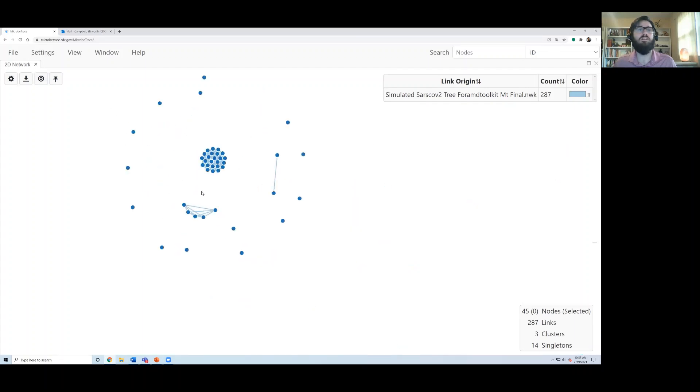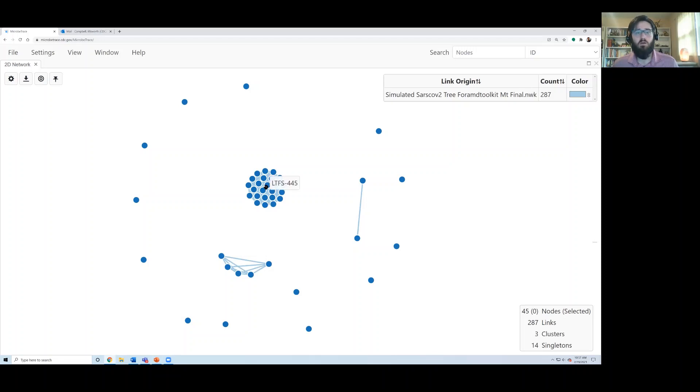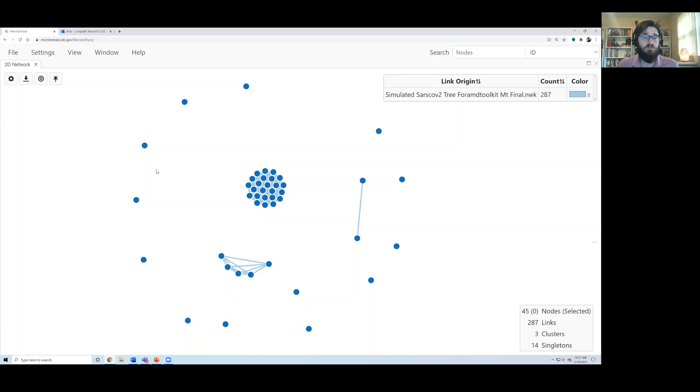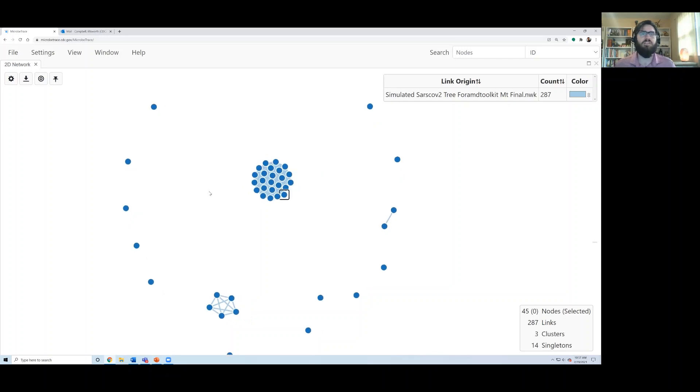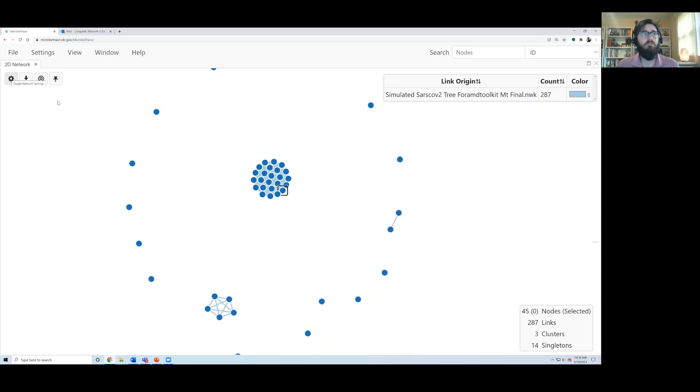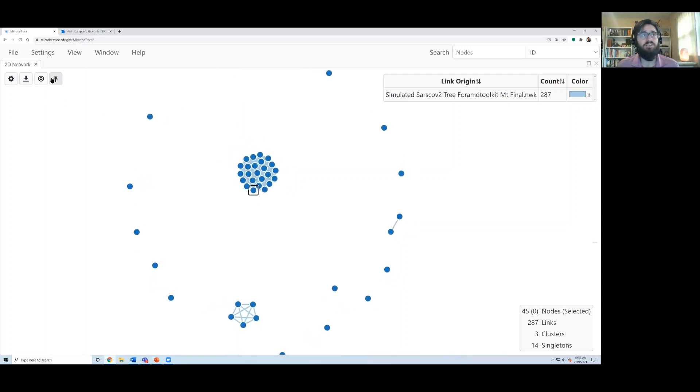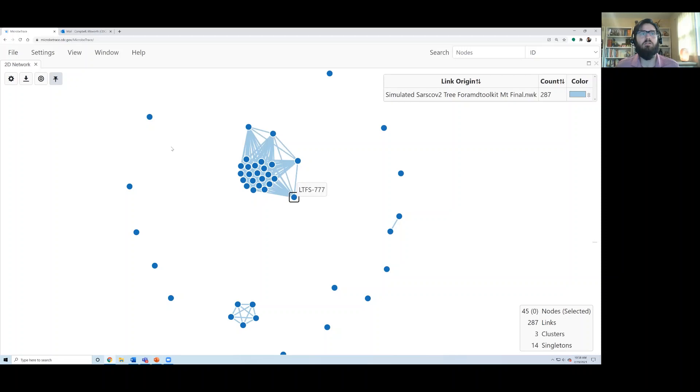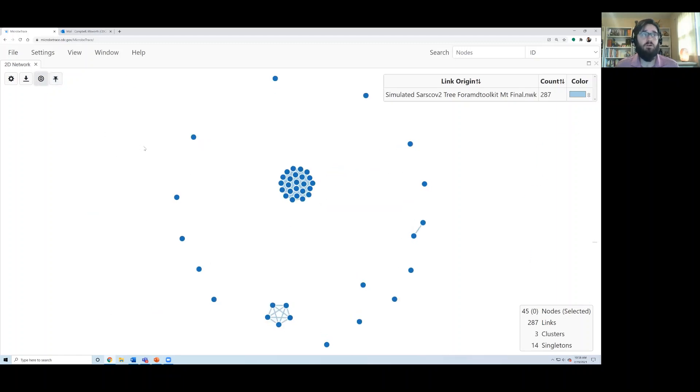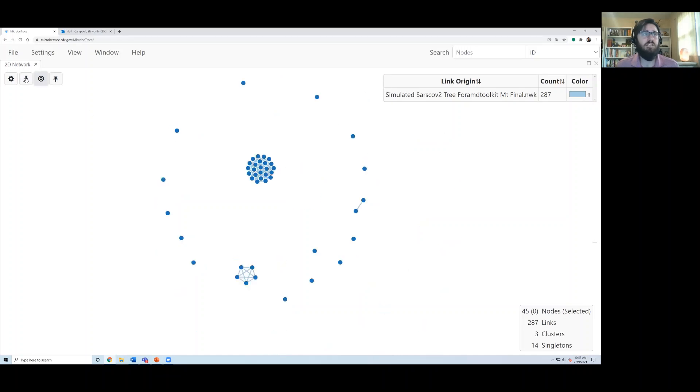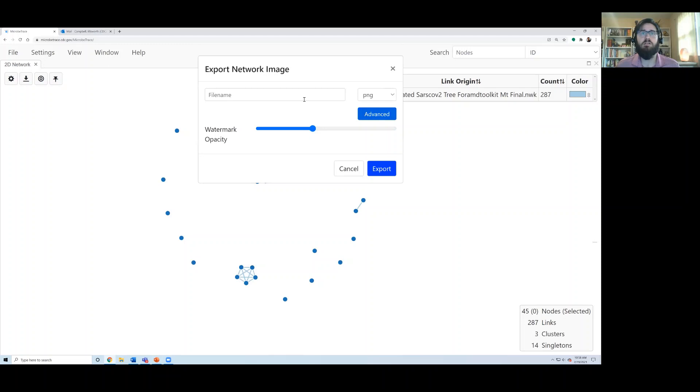And initially I want to give you an introduction to what the tool looks like. Notice that you're in a web browser, but as soon as you jump in, you will see nodes positioned on screen. The nodes are positioned according to a physics simulation. The nodes push each other away. The lines that connect them pull them closer together. Now in the top left, you'll see a variety of interaction points. First, you can freeze or pause the simulation by hitting the pin, the pin all nodes button. And then you can actually dig in and start to play around and look at particular individuals within the network. If you get lost because you're zoomed too far out, you can hit the concentric circles. The same applies for zooming too far in. If you find an image that you're interested in keeping, you can hit the download button and export it in a variety of formats, including scalable vector graphics.